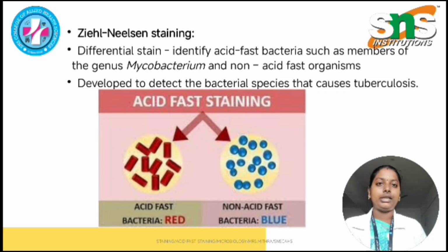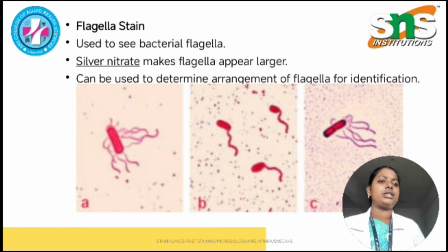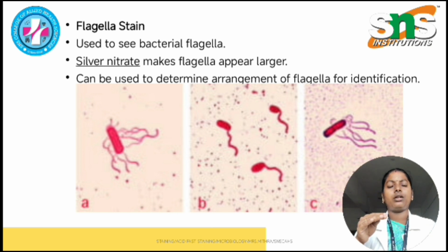Fast bacteria in detail. Before that, we have other types also. So next one is the flagella stain. The flagella stain is developed to see the bacterial flagella.